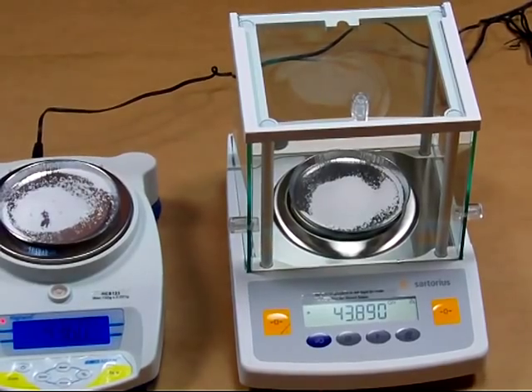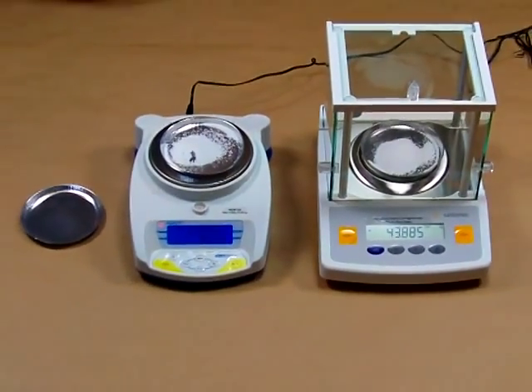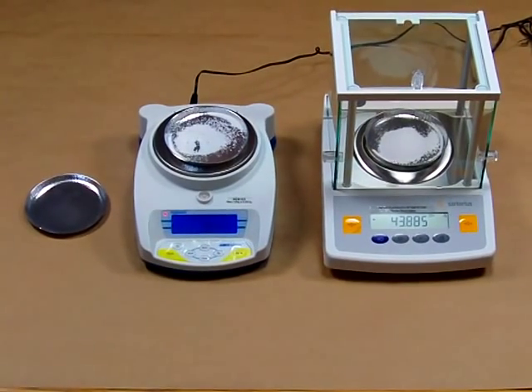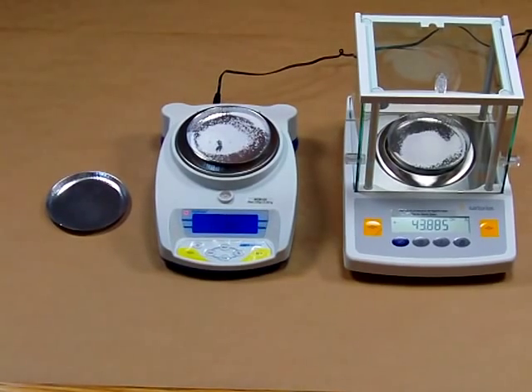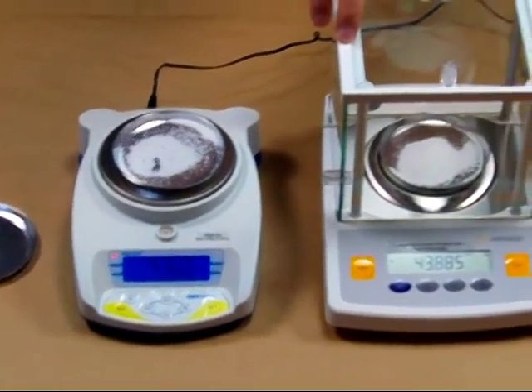We have a lot of hunters and ammo reloaders that call us looking for a scale for reloading bullets. One of the big complaints we get is that scales bought from department stores — the real low-end line — don't weigh anything accurately. When they go with the strain gauge based scale, they tell us the response time is slow or the scale keeps moving up in numbers when they're not adding anything. We try to explain that's because of the weighing technology — you have a load cell based scale versus a force restoration balance that works off of magnetism. Big difference in performance.